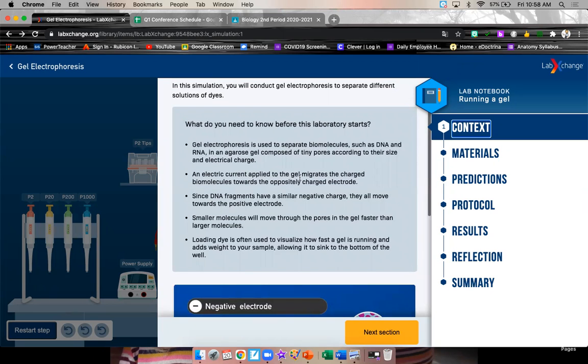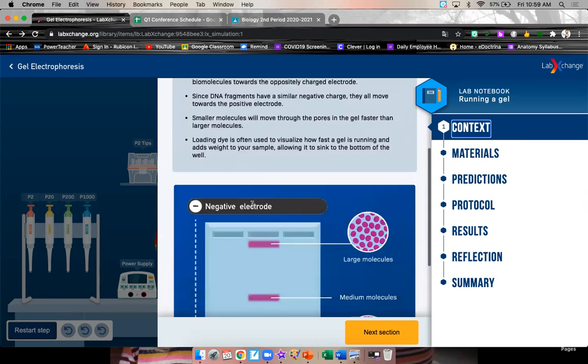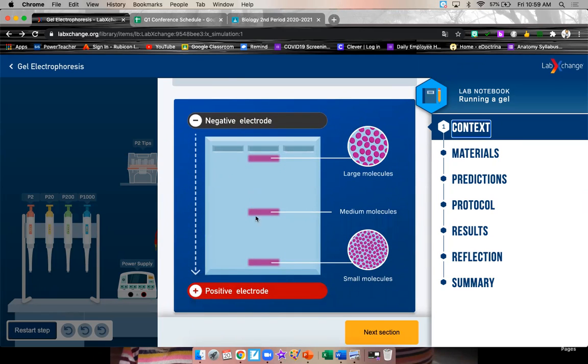An electric current applied to the gel migrates the charged biomolecules toward the oppositely charged electrode. Since DNA fragments have a similar negative charge, they all move toward the positive electrode. We're going to hook this bad boy up to some electricity. And electricity moves from a negative charge to a positive charge. So all the electricity is flowing in this direction. Your DNA is also negatively charged. And if you learn anything about magnets, you know that like charges repel each other. These are negatively charged. They don't want to be on the negative side. So they're going to get repelled away. Negative charges are drawn to the positive side. So they're going to get drawn toward the positive side of this agros gel. So that's what's going to make them move, the electric charges.